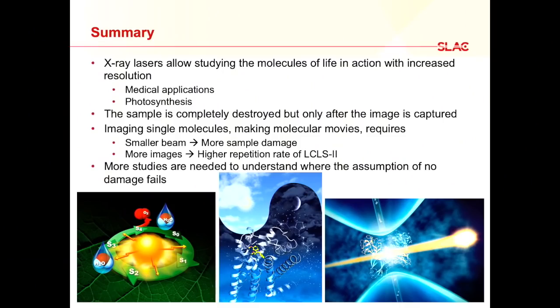We're trying to get a structure of a molecule by flowing little crystals inside a jet that gets completely destroyed by our beam, but not fast enough to prevent us from performing these measurements. So as I said, we study the molecules of life in action. Every day we come to work and we drive towards that goal. And thank you.